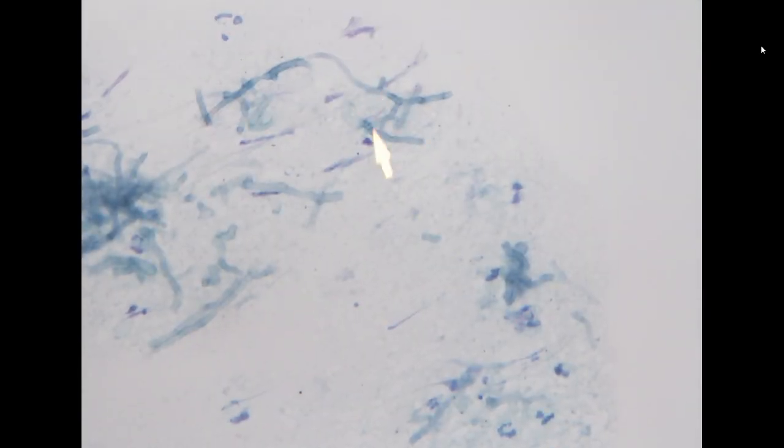Okay, so this is Aspergillus. So let's save these for teaching slide.